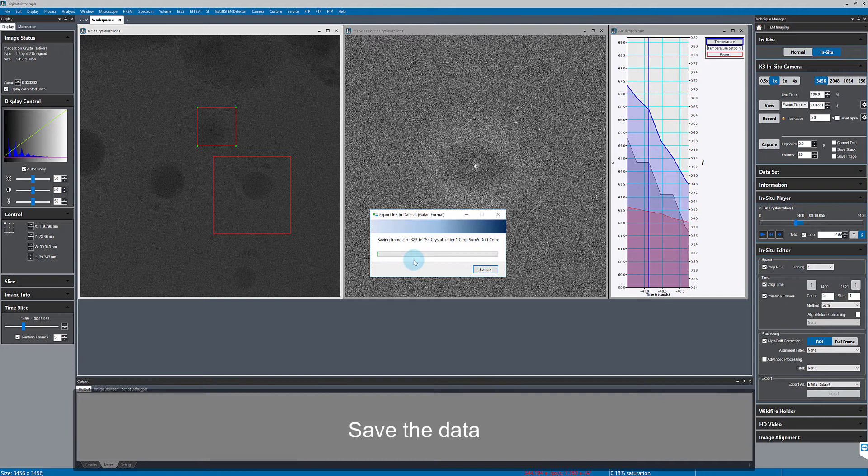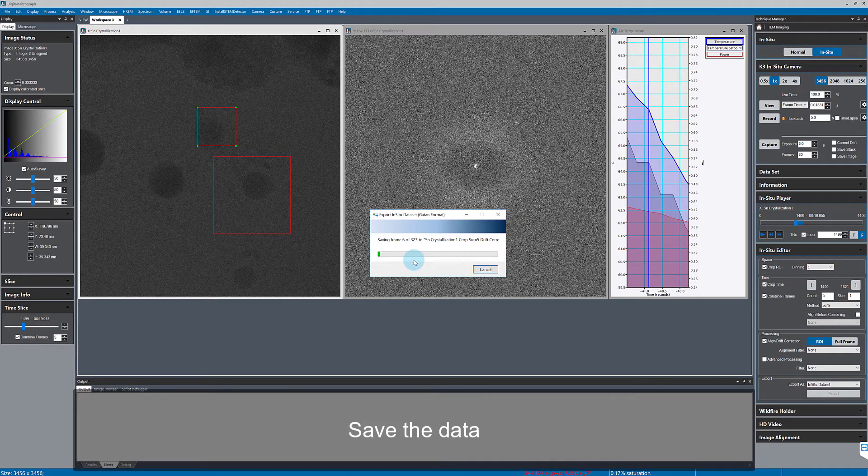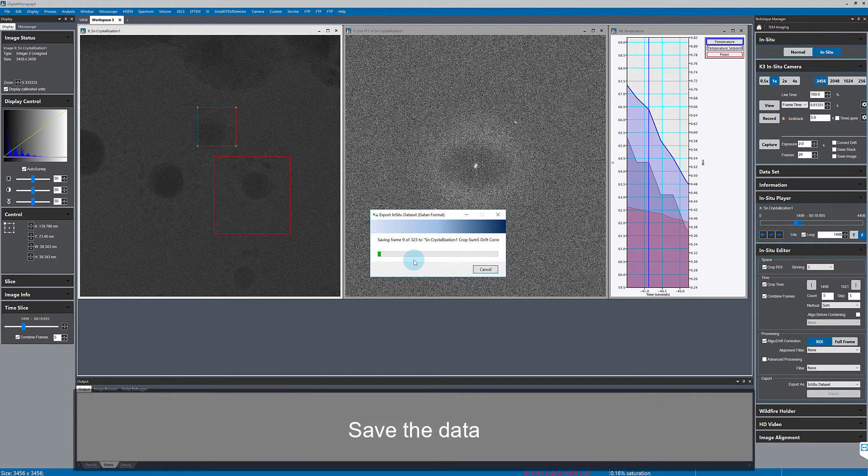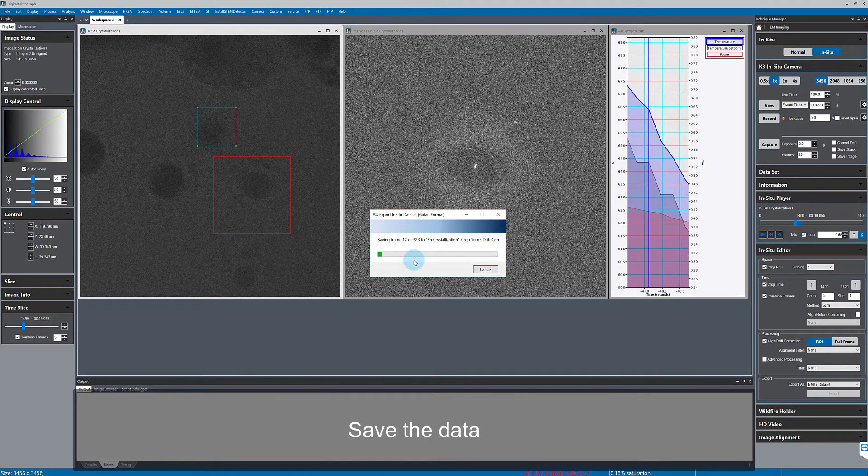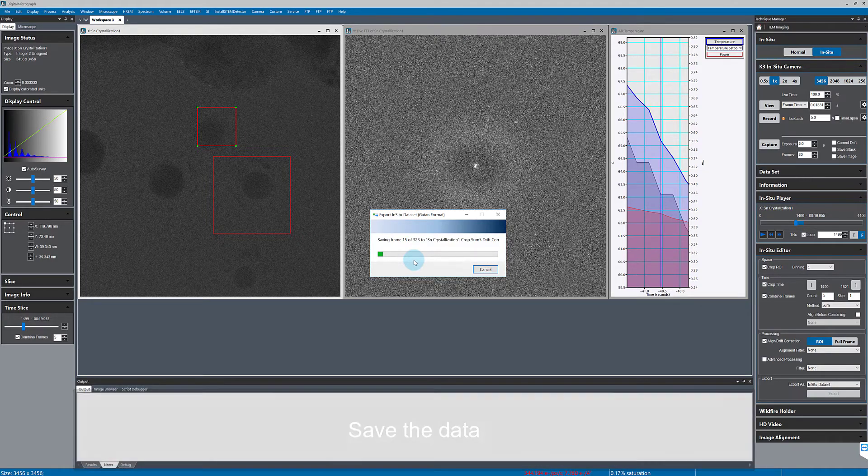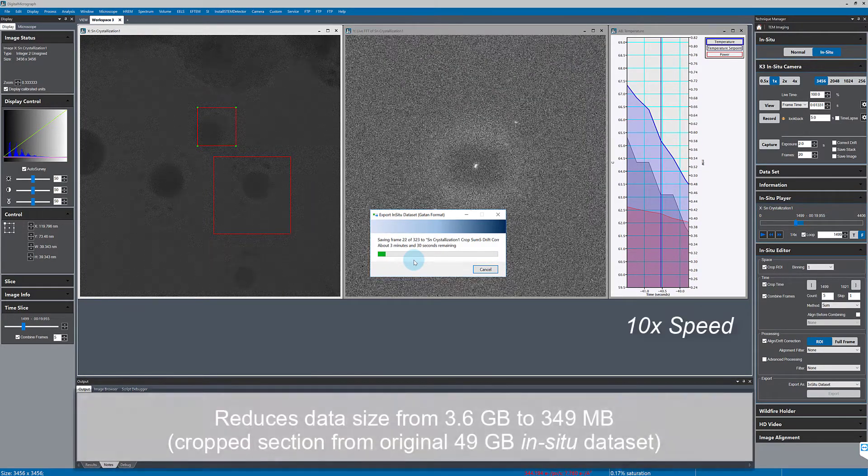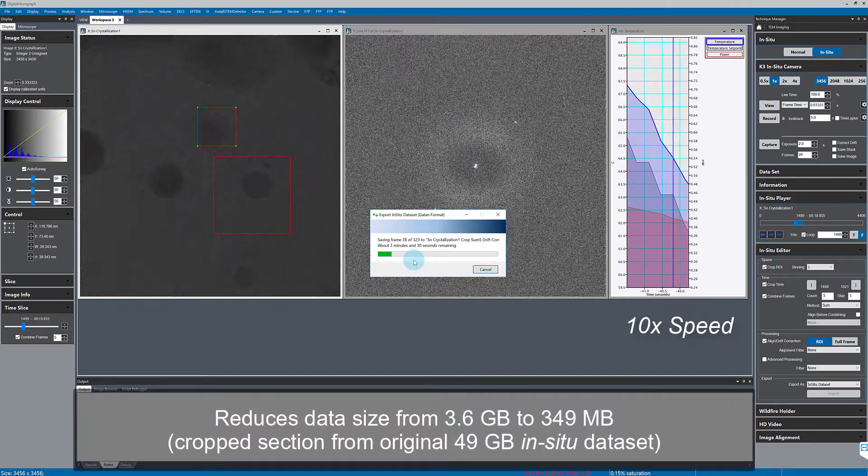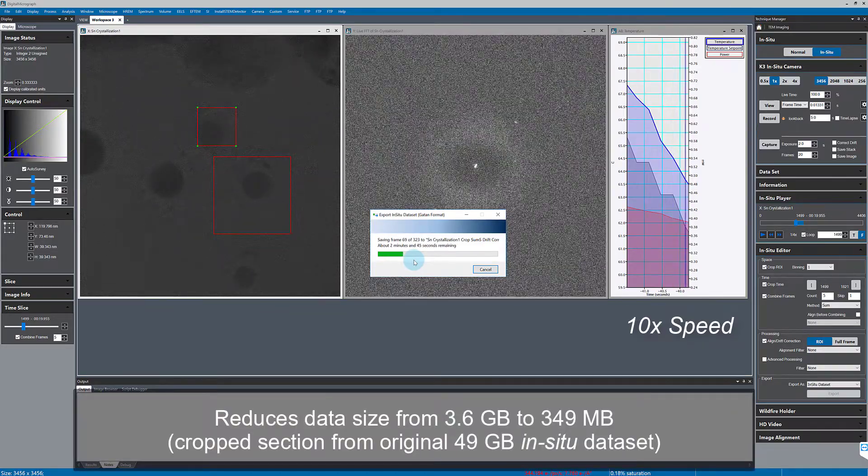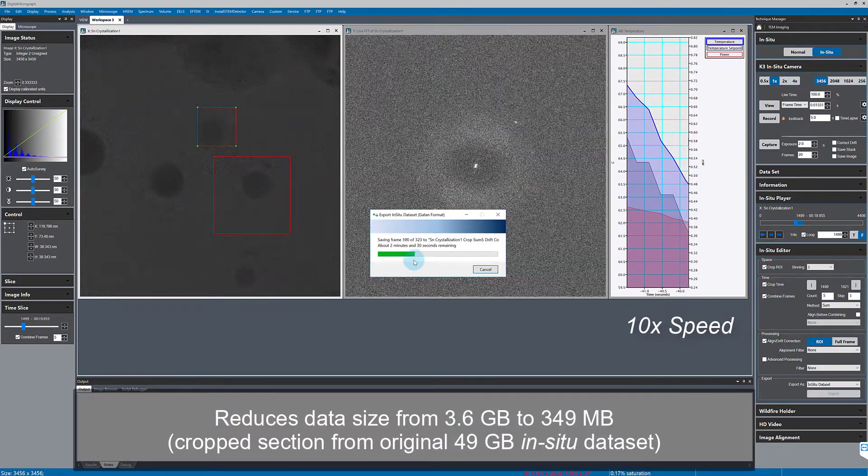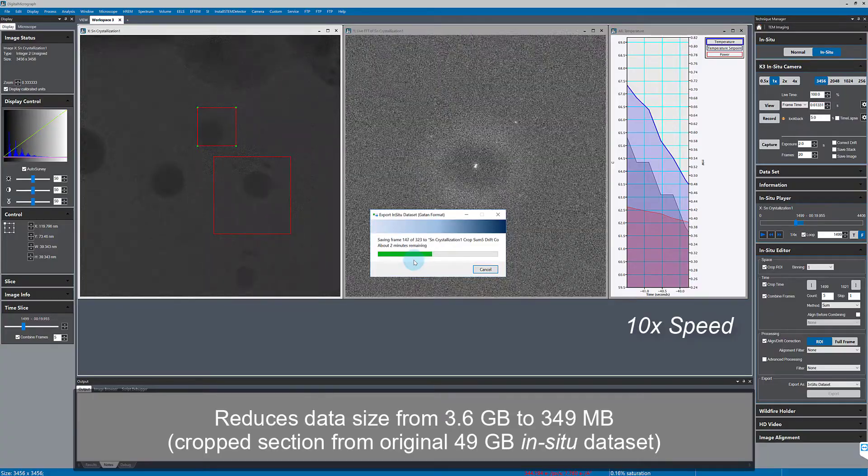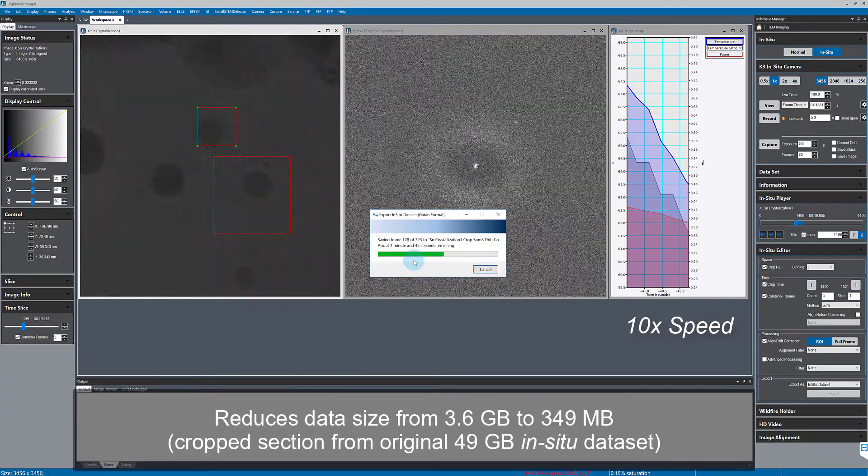Now it's going to go through frame by frame, drift correcting and cropping the data before saving each frame in dm format. I've increased the playback speed here, but this just takes a few minutes to process this 3.6 gigabyte section of the data set.